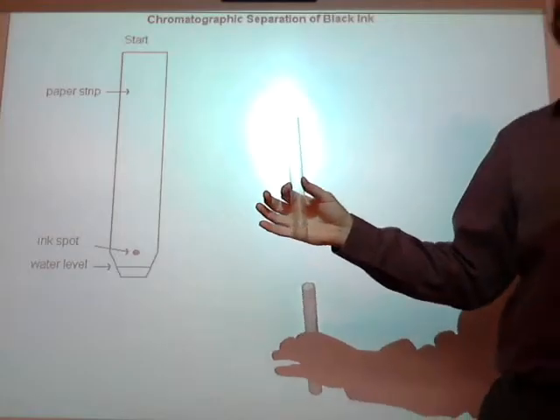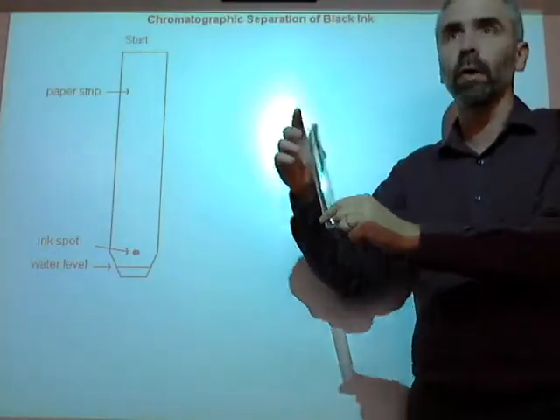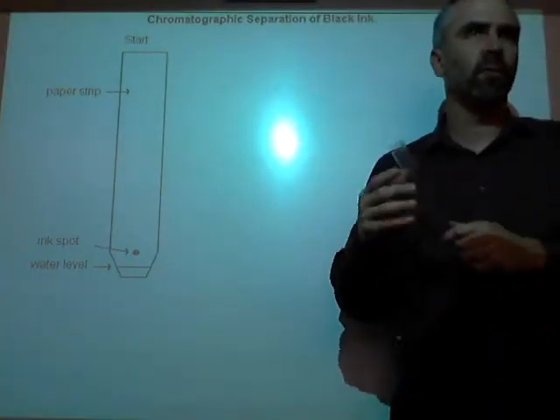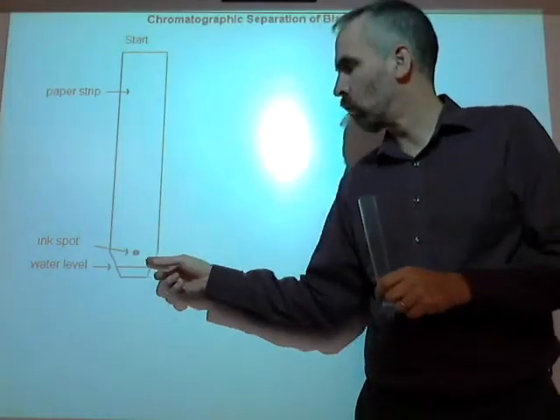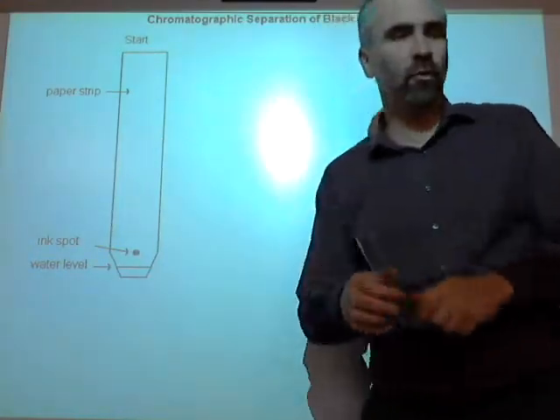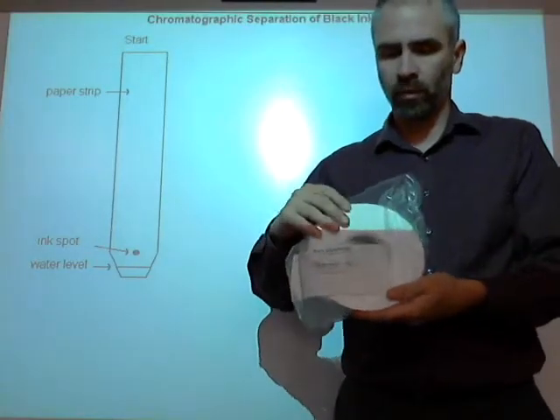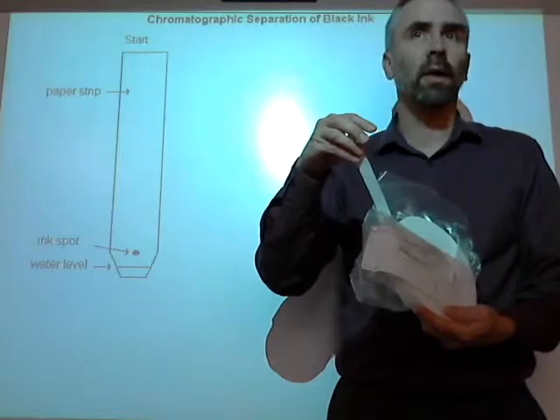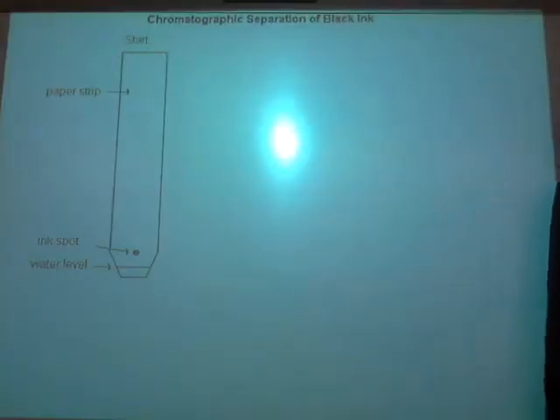All right, take a look. You have this plastic tube that has a lid that goes on it. You're going to put in the bottom of that some acetic acid solution, acetic acid and water. That's where the water level will be at the bottom. Then you put your filter paper, which you cut out of here. You've got to be careful. This is just a strip of paper, and you'll cut it to the right length. And you'll make a line at the bottom in pencil, not in ink. Why not in ink? Yeah, the ink will run, so you make it in pencil.